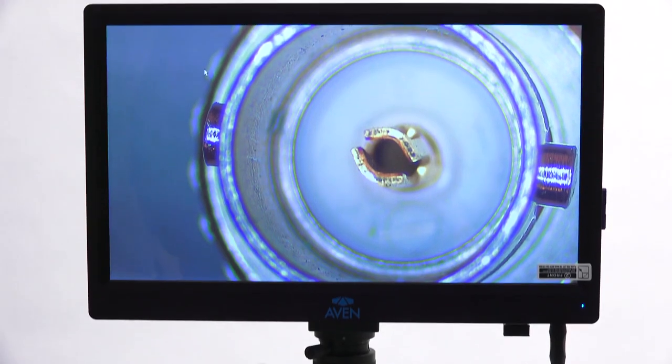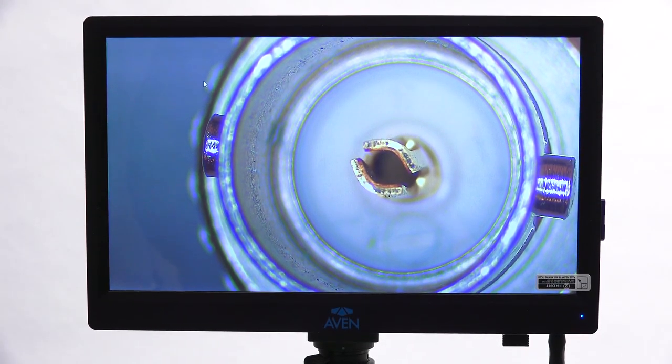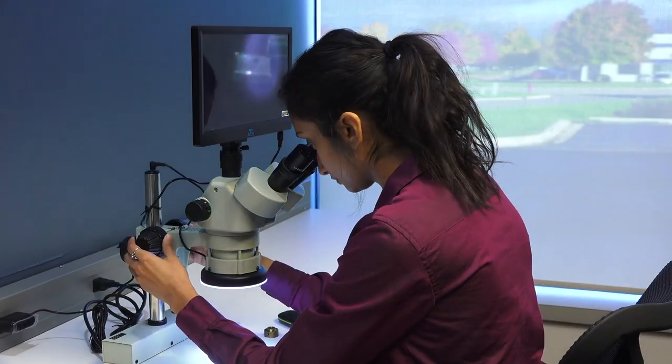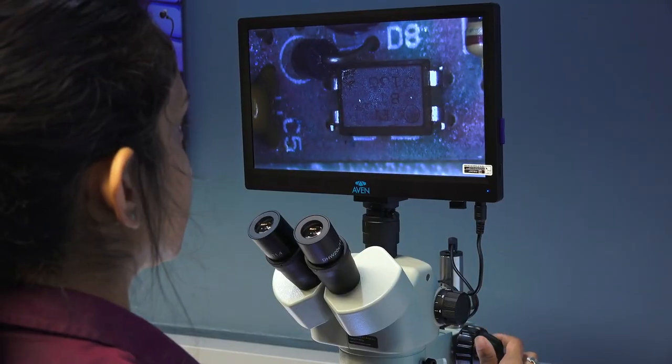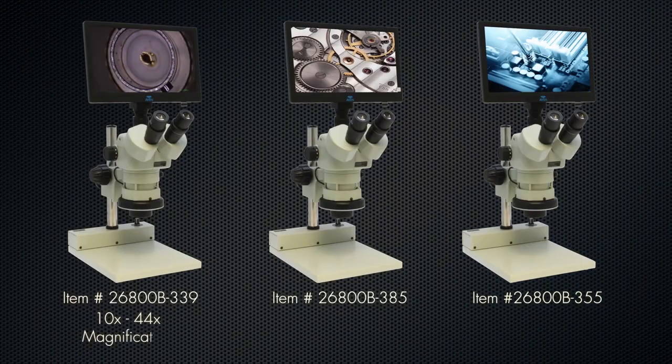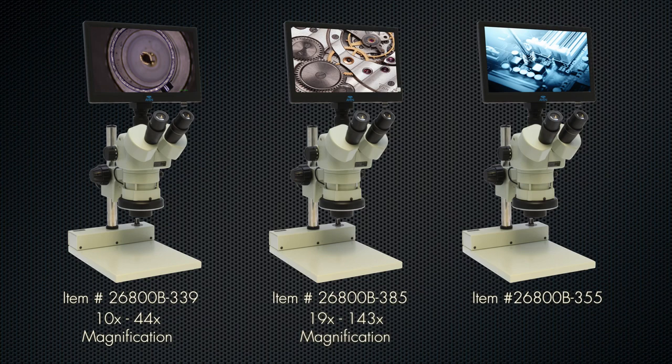Aven's Eidos microscope systems offer users the ability to view objects through the microscope eyepieces or on the monitor with magnification ranges of 10x to 44x, 19x to 143x, or 40x to 258x.